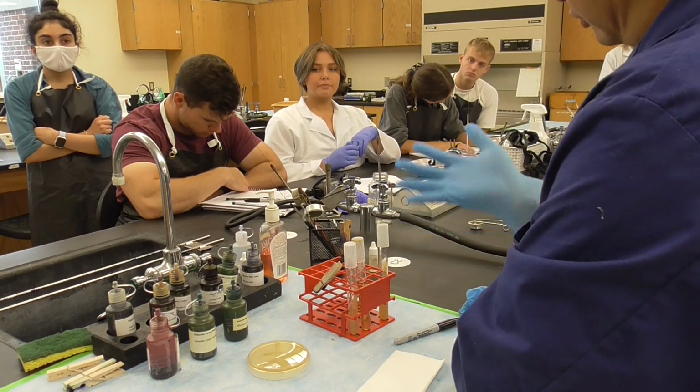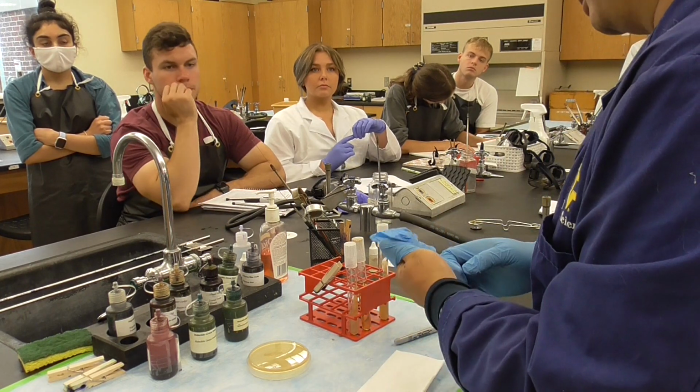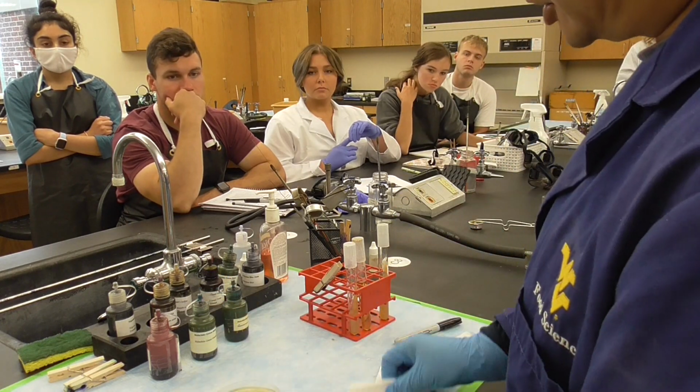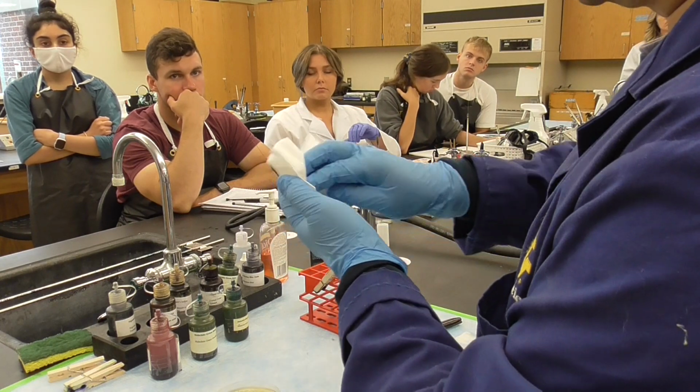In case you didn't notice, sometimes you will see this agar plate is very wet. I would suggest you use paper towel to clean the liquid from the inside first.